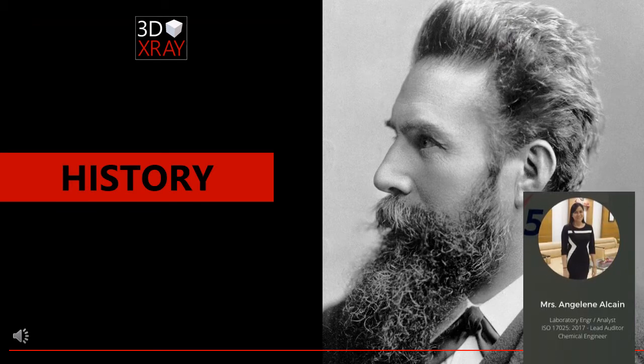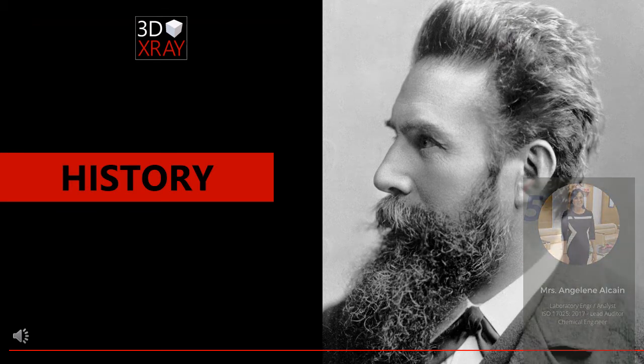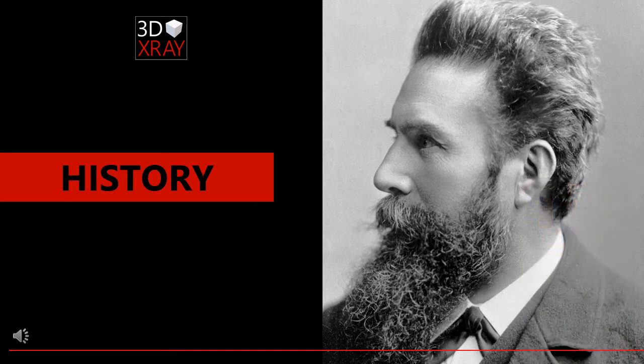Before we go further, let me discuss to you the brief history of X-ray, how it was discovered, and its development up to the computed tomography or CT.